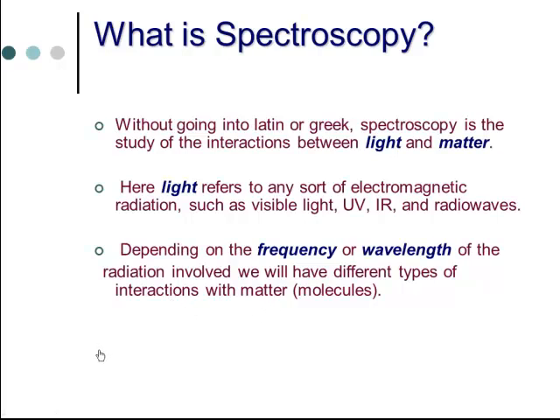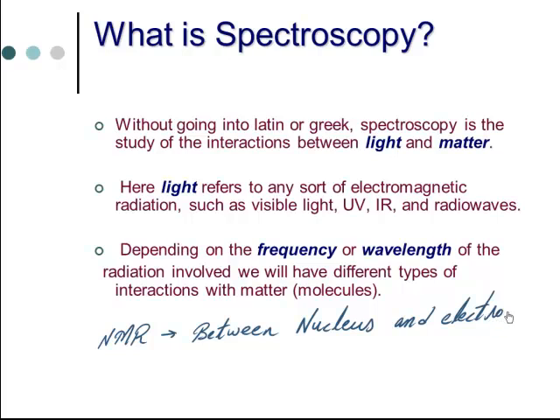And the type of interaction involved in NMR is the interaction between the nucleus and electromagnetic radiations which belong to the radio wave region.